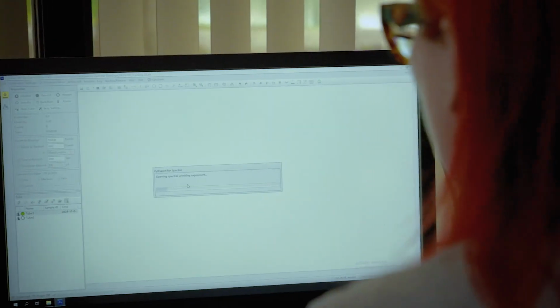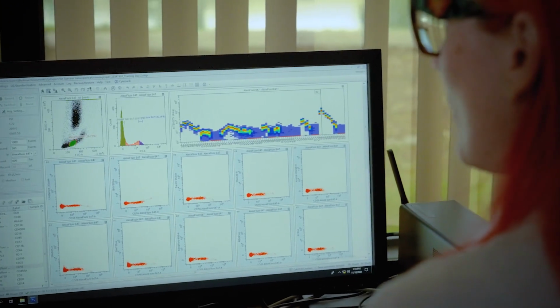With ever-increasing experimental complexity, spectral flow cytometry lets you explore and expand in the pathways you are investigating. The collection of the full spectrum combined with an advanced unmixing algorithm will make your high-complexity data easy to analyze. The concept of modularity will allow you to have both a true conventional and spectral instrument in one. This will help for crossover studies or for panels that are growing in complexity.